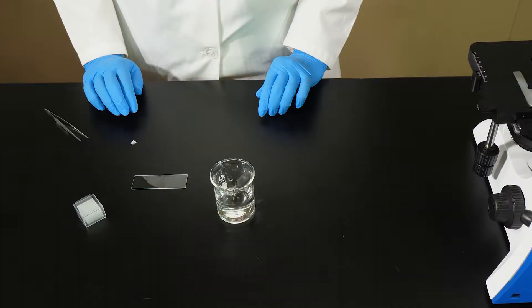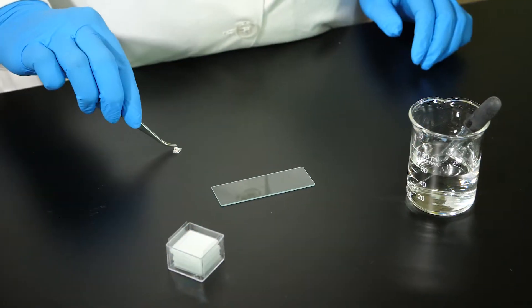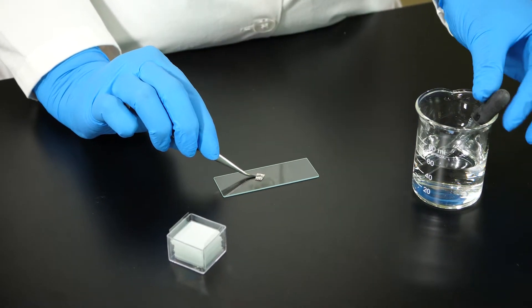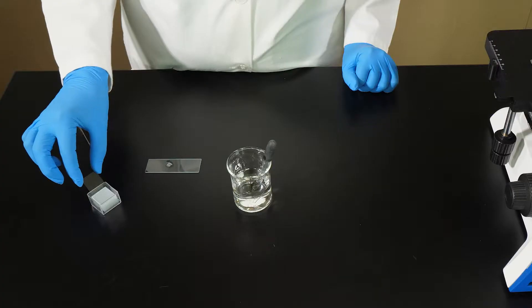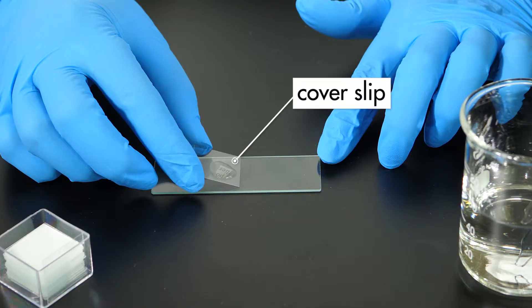To demonstrate the steps in preparing a wet mount slide, we will use a tiny piece of printed type cut from a newspaper. We start with a clean glass slide. Forceps are used to place the specimen in the center of the slide. A pipette is used to place a drop or two of water to cover the specimen. Now it is time to add a cover slip.